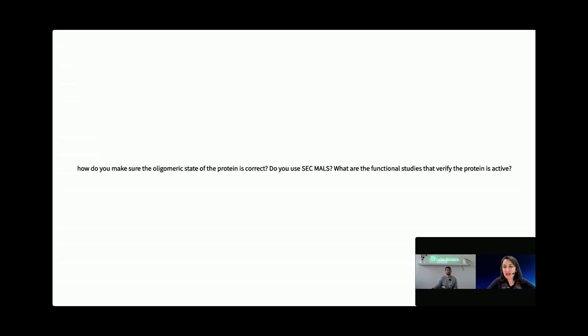Thanks, Philipp. So actually moving into the topic of measuring functionality with binding affinity. There is a question here that includes SPR. So I'm going to push it to the slide area for you and for the audience. They are asking about the nanodiscs and if they have a charge, and SPR chips are typically negative. So how do you navigate electrostatic repulsion in this case?